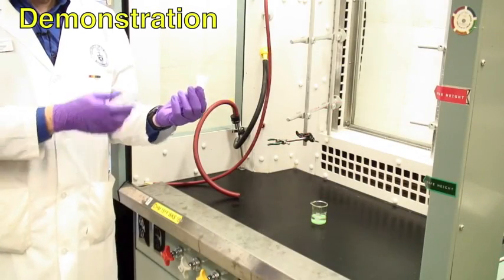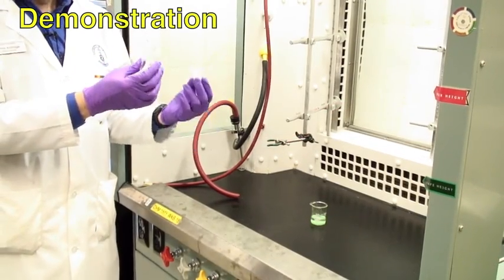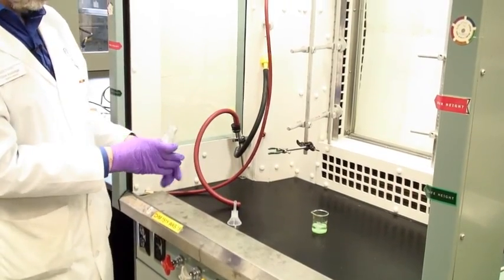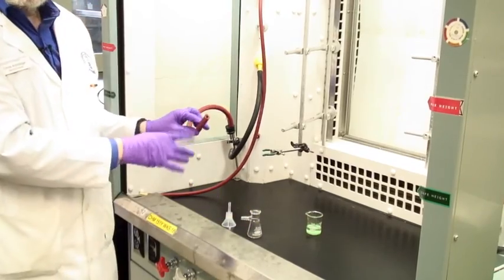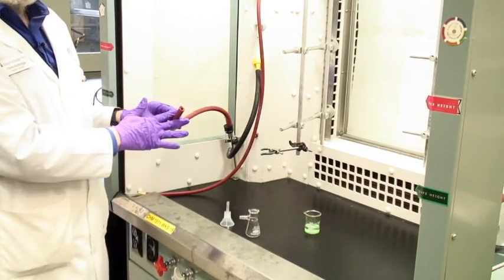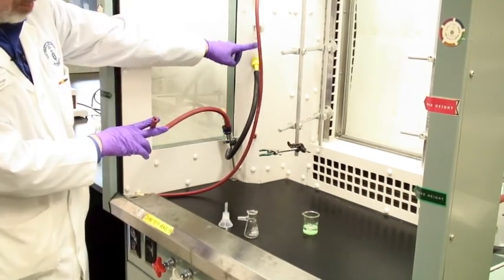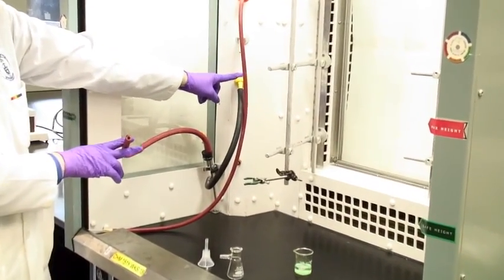This is a Hirsch funnel and this is a Buchner flask. You'll use them here in a fume hood because this is where you'll find the vacuum. The vacuum comes through this heavy wall tube. Sometimes it's black, sometimes it's red. Here is the trap back here and the vacuum actually comes through this yellow nozzle.